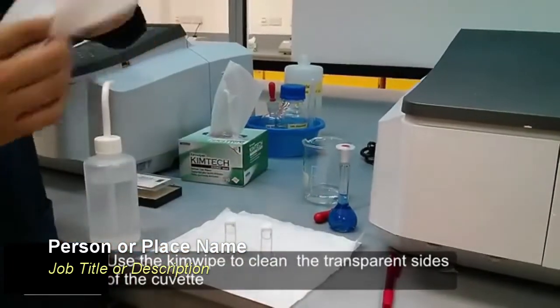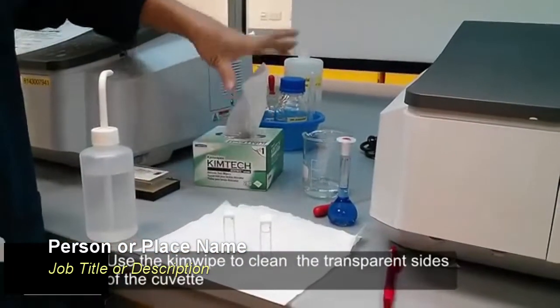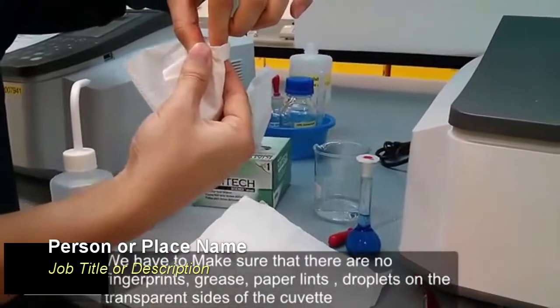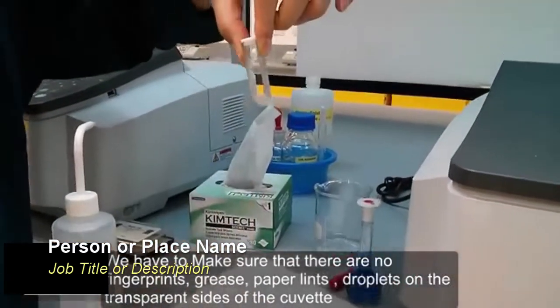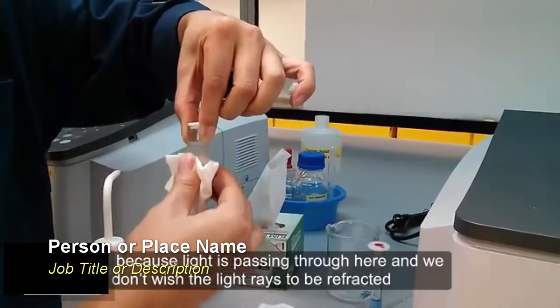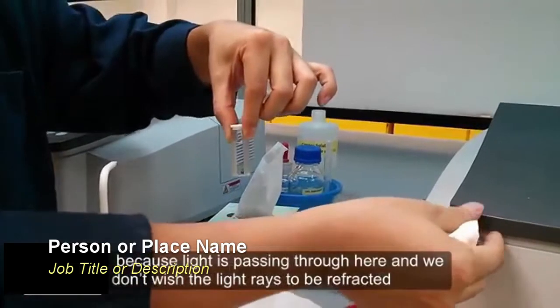Now use the Kim wipe to clean the transparent sides of the cuvette. We have to make sure that there are no fingerprints, grease, paper lint, or droplets on the transparent sides of the cuvette, because light is passing through here and we don't wish the light rays to be refracted.